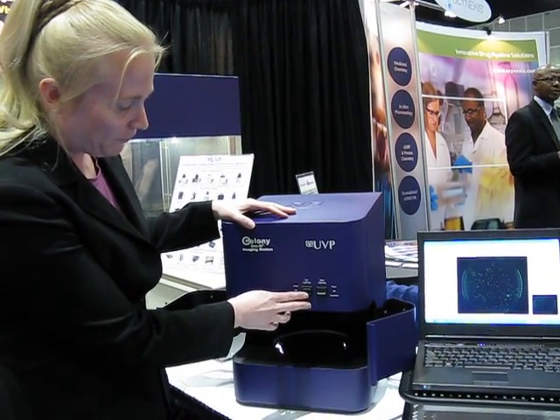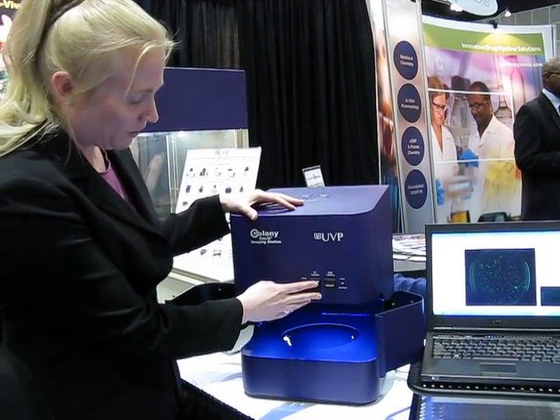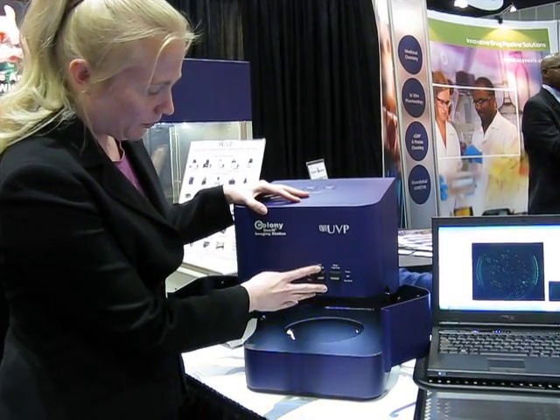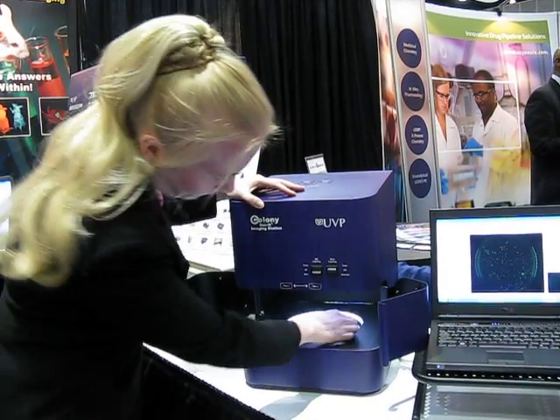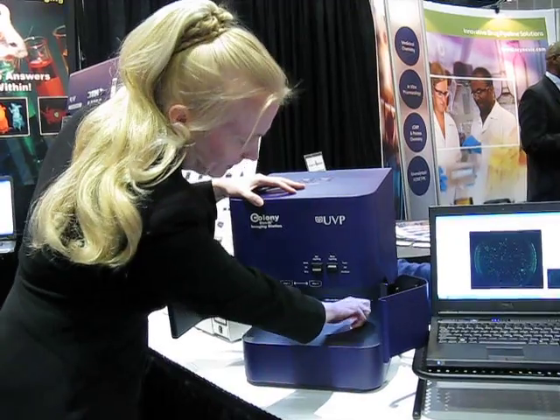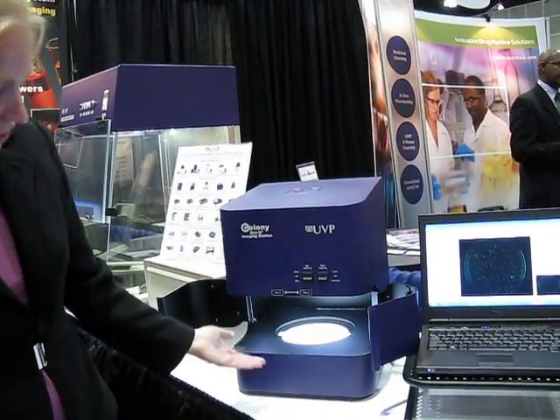Then what you want to do is select from all the different lighting options. For GFP we have blue, but for other colonies — regular white-like colonies — you can also choose the white, and then we have your dark-field lighting. And finally, we have the trans-illumination lighting, which is the real bright light.